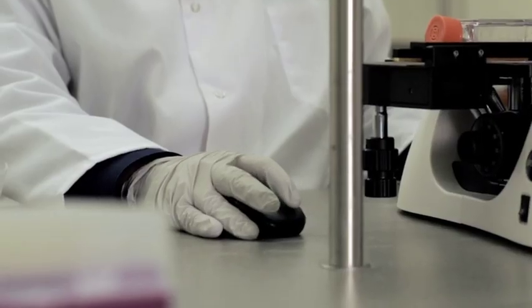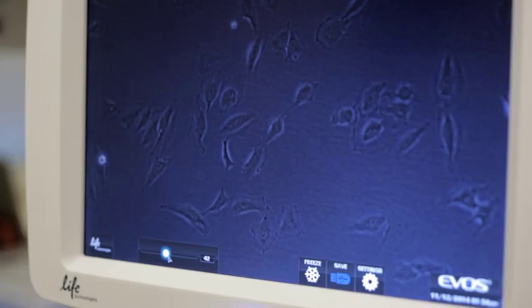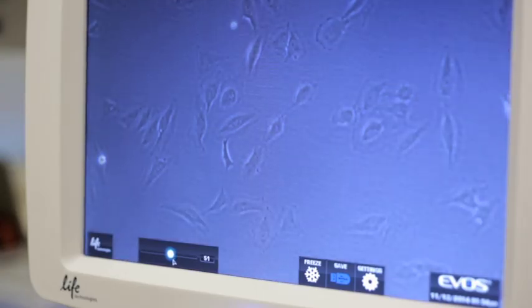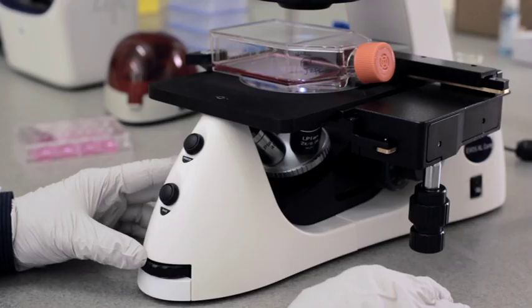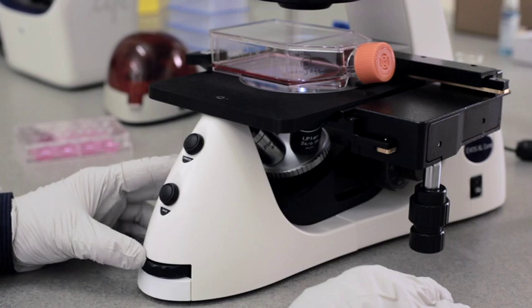The light intensity is controlled by the mouse by scrolling up to brighten the image and down to dim the image. Light intensity can also be controlled using the control wheel located in the front of the instrument.